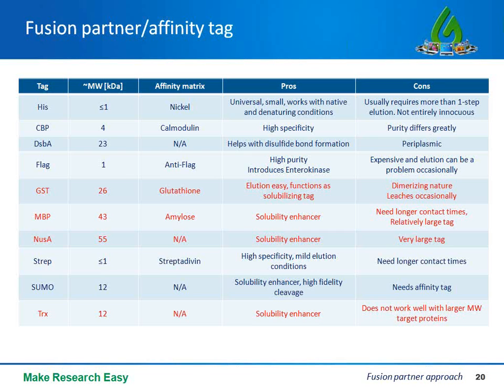Also, you need to decide whether the tag sits at the N terminus or the C terminus. While many on this list can be engineered at either end, some perform really well at one end over the other. So the advantage of having an N-terminal tag is that the construct can utilize the efficient translation initiation signals of the tag, right?